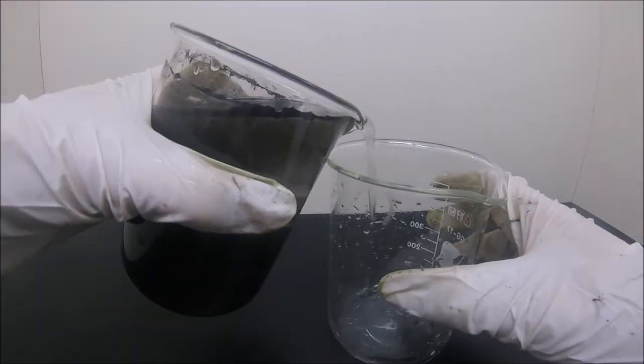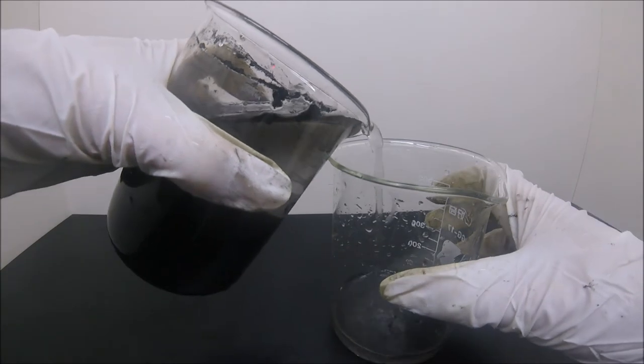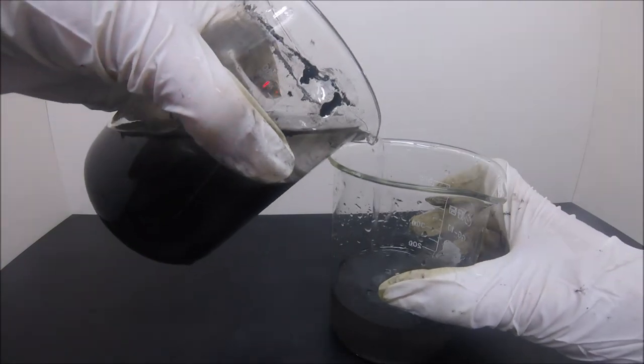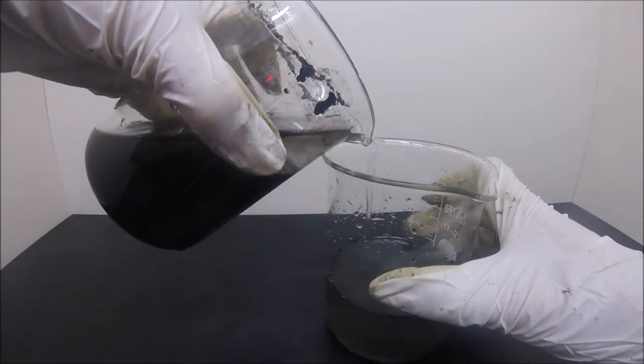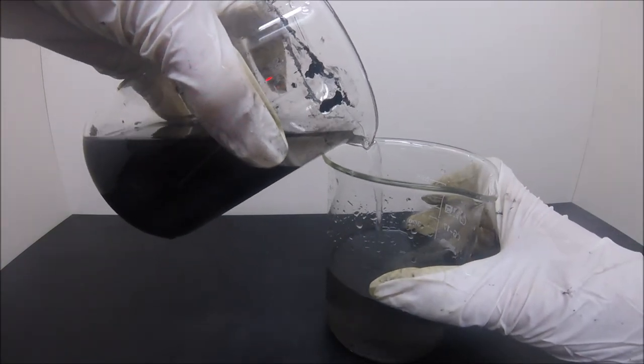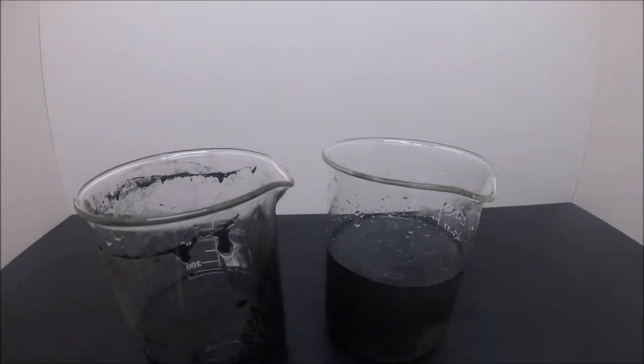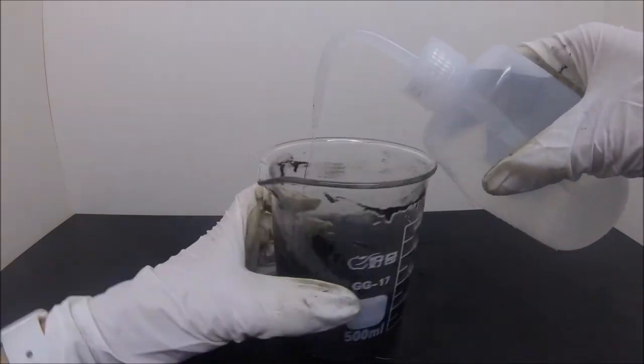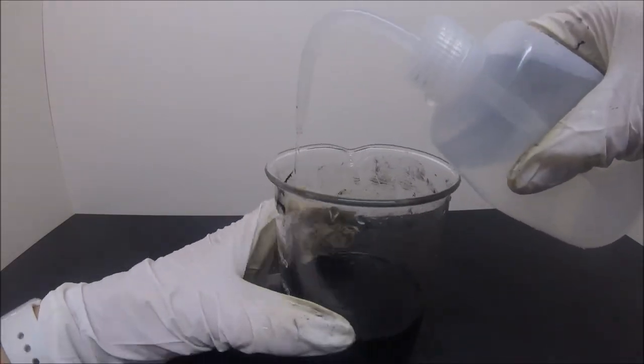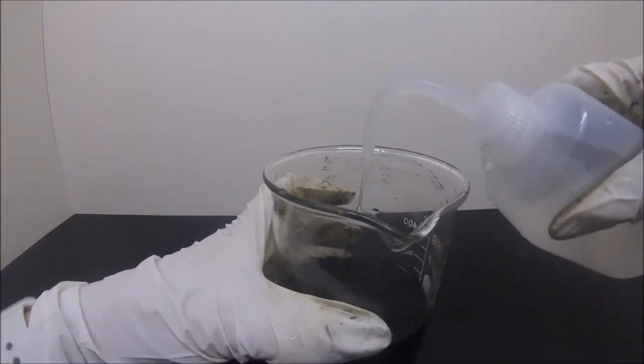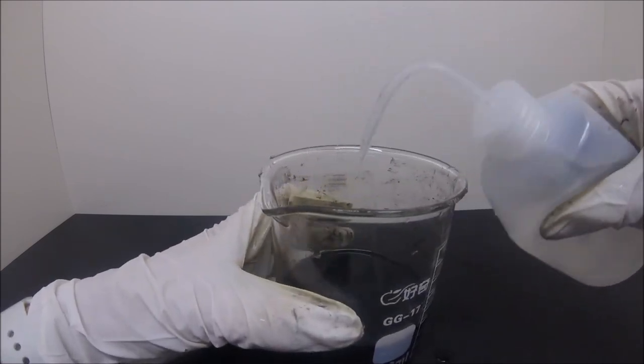Now let the suspension settle down to the bottom and decant the water. And repeat the washing process all over again.